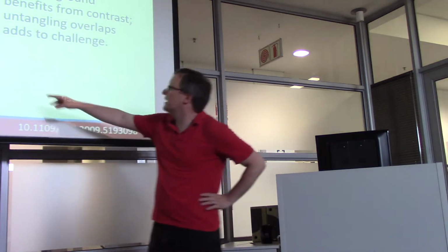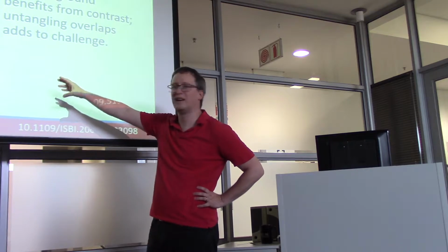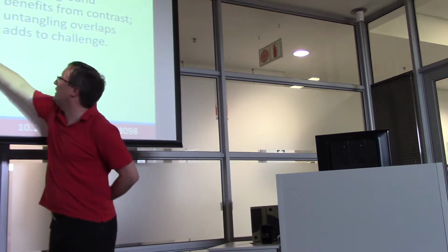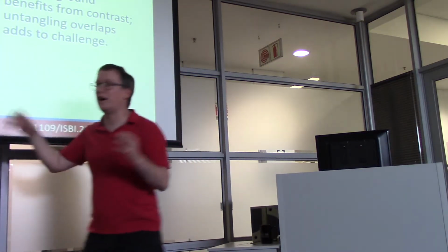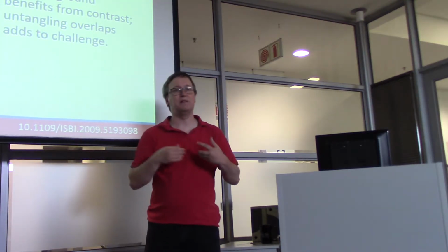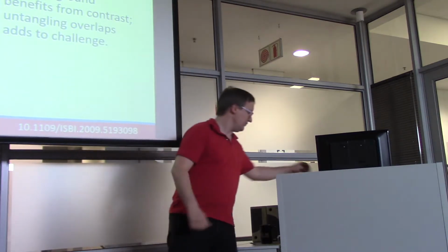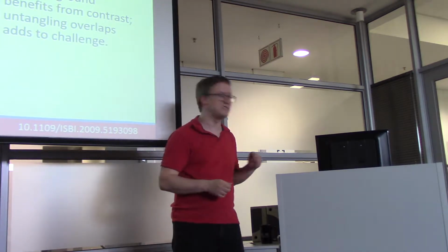For segmentation, we can imagine that in this case we have cell nuclei that we've stained with Hoechst. You can probably pronounce that better than I. And we have them in this field, and now we need to be able to differentiate these nuclei from their backgrounds. You can see that when you have a cell way down here that's not next to any others, drawing a little red boundary around it is not a problem. But when you have a whole bunch of these nuclei all bunched together in one place, now you have overlaps that are a lot harder to deal with. So this is an example of why segmentation can be very hard. If you look at the slide on your laptops, you'll see that the software has drawn in little red boundaries on each of these nuclei as well. It maybe is not as clear here. So remember, that's kind of the positive and negative thing. How can we pick out an object versus the background in front of which it sits?